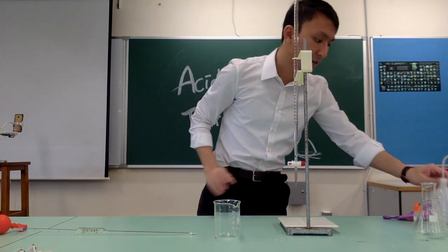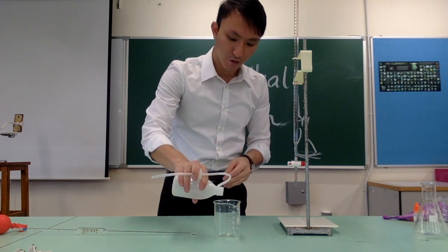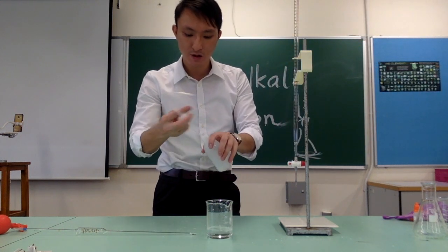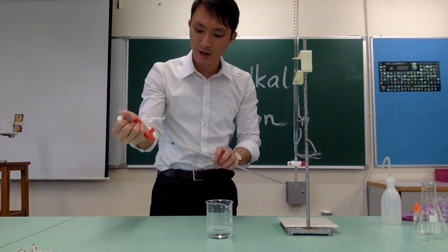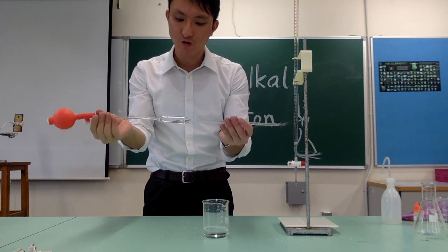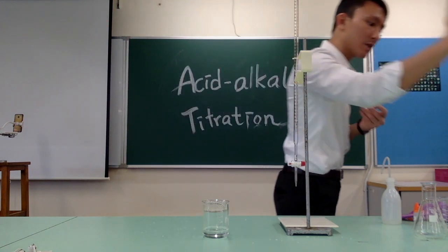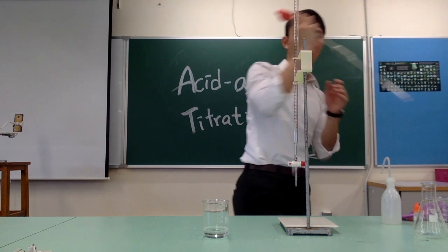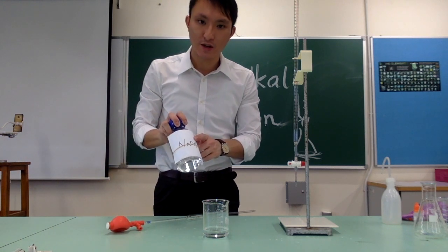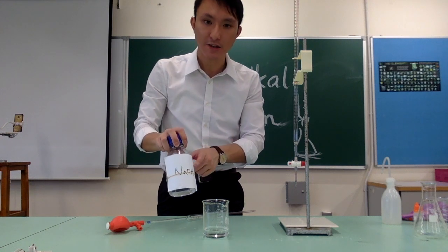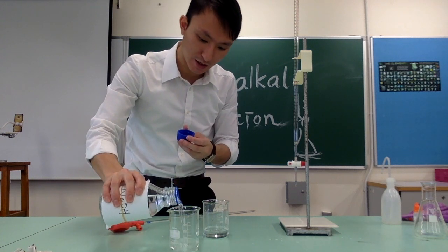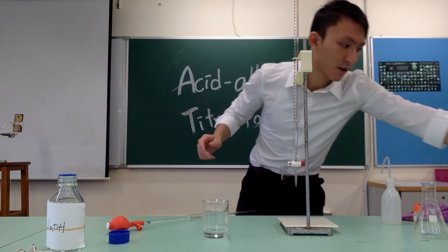Let's get started with the rinsing. First, take a beaker and add some distilled water. Roughly rinse the pipette, pour the distilled water out, then attach the pipette filler and suck up the solution. No need to add too much — gently roll the pipette and then discard the solution.